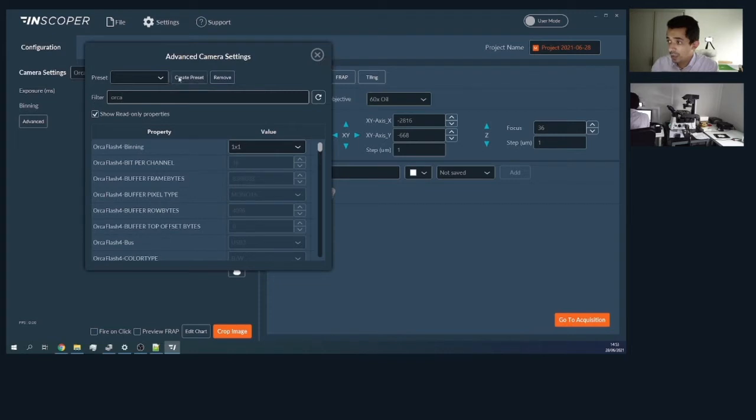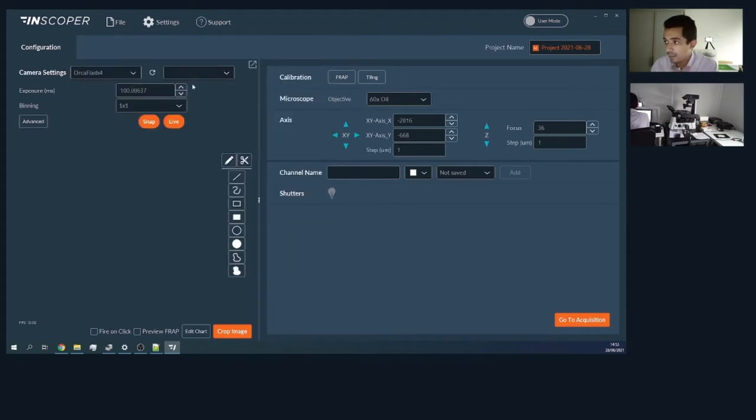So here also we can create presets of the different settings and save them as a list, and then when the user clicks on an element of that list, the user interface will set all the values of all the parameters of that preset. The user interface also can deal with up to 4 cameras. So here you have the list of all the cameras available.